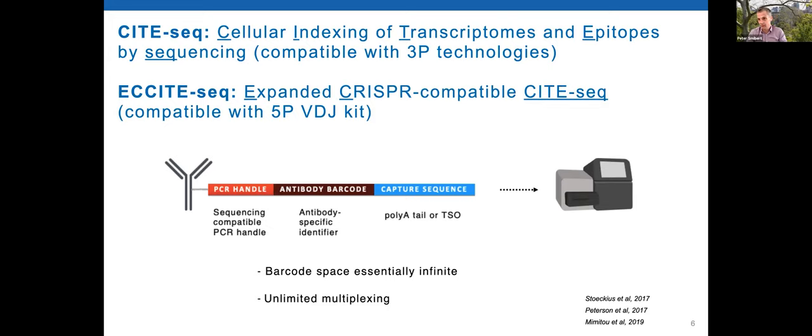And there's a bunch of other sequences available. 10x themselves now have this feature barcoding method, with a proprietary sequence that you can attach to. And there's even a separate set of oligonucleotides that are compatible with Mission Bio's single cell genome sequencing solution.